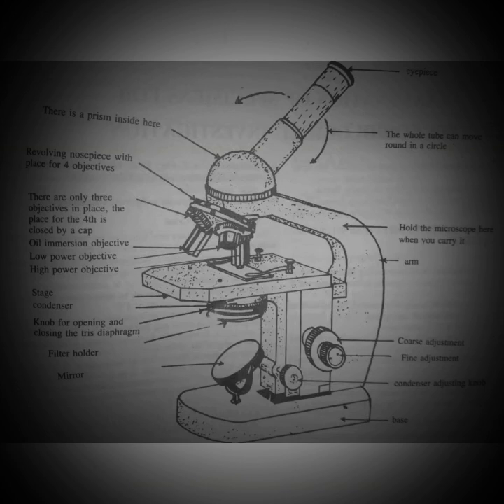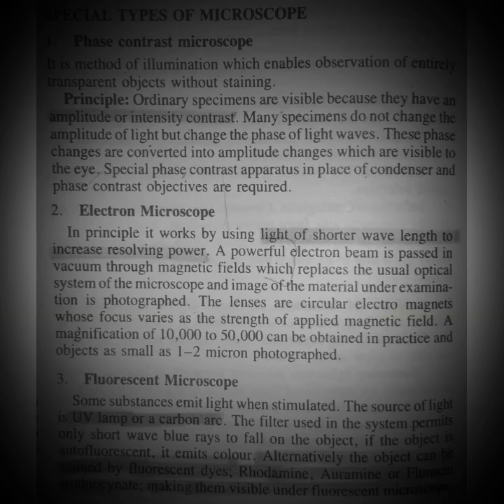Okay, and here in oil immersion you can use xylene to clean it. Okay, so now the types of the microscope. Firstly, listen to the names of the different microscopes. There are different types of microscope like dark field microscope, phase contrast microscope, polarizing microscope, fluorescence microscope, and electron microscope.